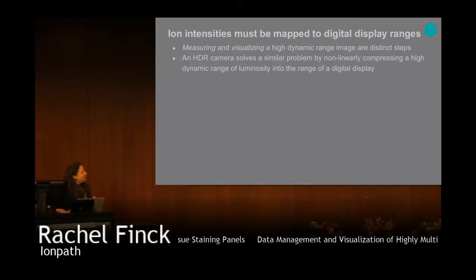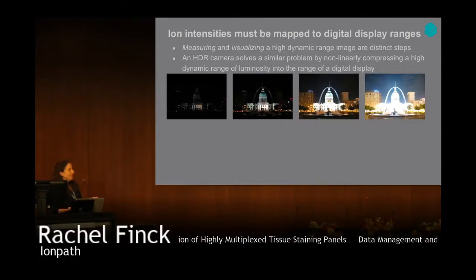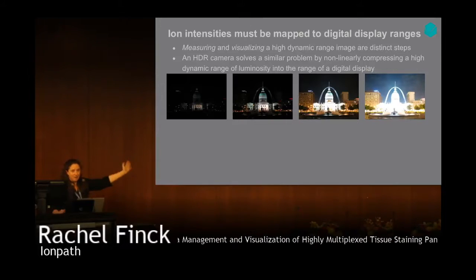And so just an approximate analogy is that the dynamic range of your camera is actually bigger than what you can display in a picture. It's bigger than what a screen naturally displays is what I meant to say. And so we're all a bit spoiled by this now, only recently, because you go into HDR mode and you see all that nice contrast in the dark stuff and in the bright stuff without it either being too dark or oversaturated.